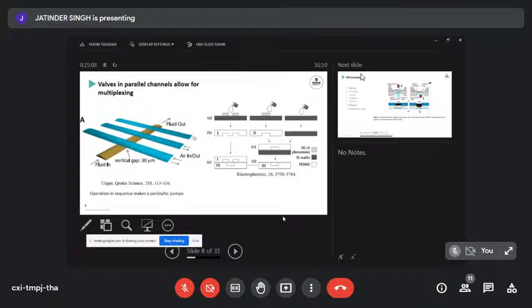And what happens is if we increase the air in, we increase the pressure, which means that the bottom of this channel blows up like a balloon. It's an elastomer. We've had the PDMS device, you can feel it, it's kind of soft. If you've got PDMS that's only 50 micron thick, it works like a balloon. So you increase the pressure here, the material, the balloon, inflates, and it closes the channel that sits underneath.